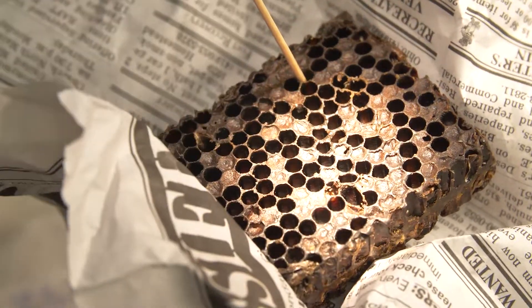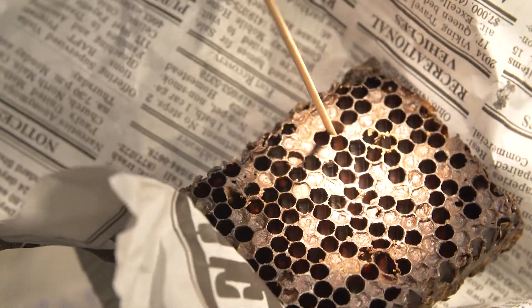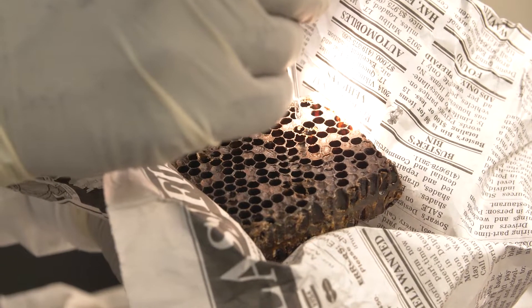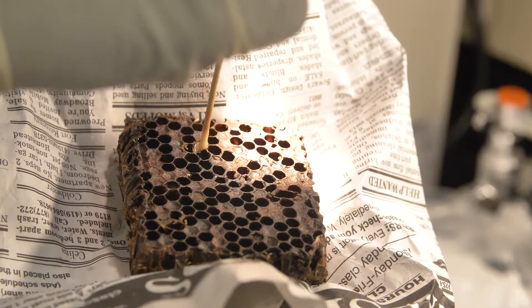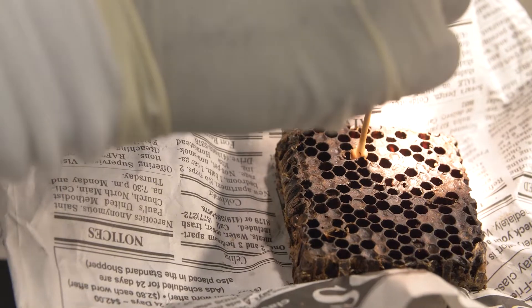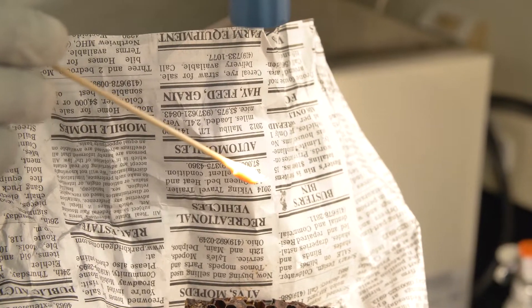For our diagnostic purpose, to see if American Foulbrood spores are actually present, we soak the identified cell with just distilled water — about two drops. After giving it a few minutes, we swab out the remains of the larvae in the cell. You can see the water discoloring to a dark brown color — that is the dissolved remains that were sitting in the brood.